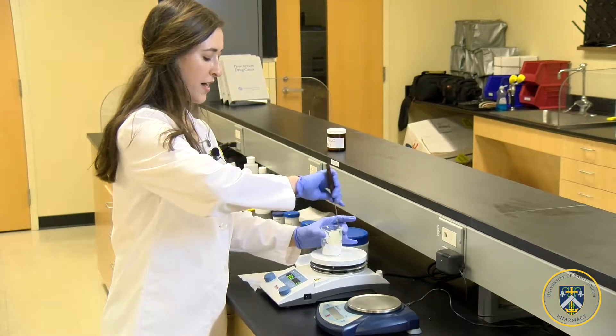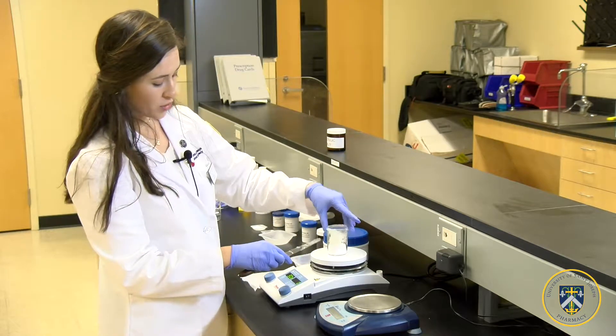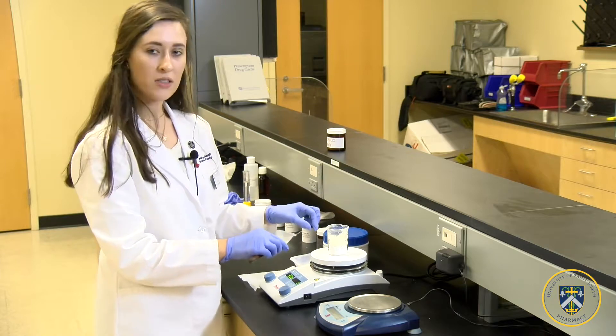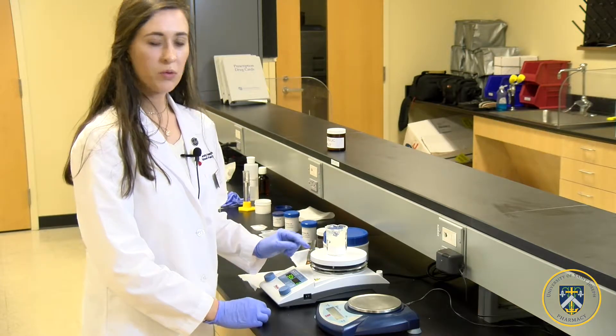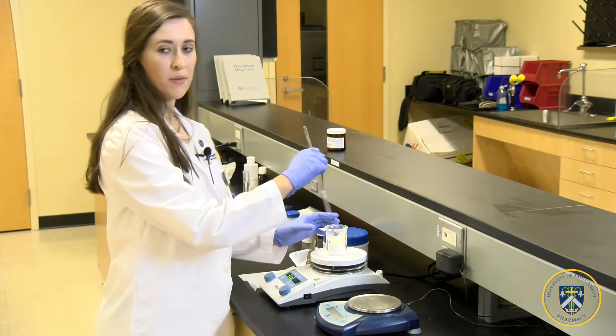Be sure that the petrolatum doesn't try to mix or touch the stearyl alcohol, so that they both will melt simultaneously on the hot plate. As this is melting, we will use a glass rod to stir the mixture together.